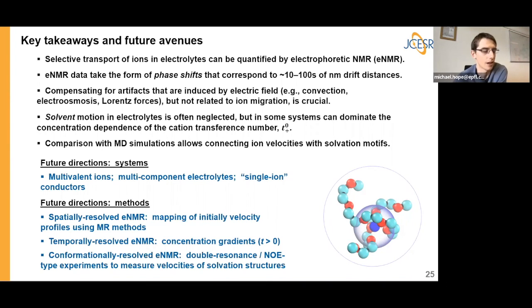Okay, thanks. Another question from Walt Musevsky, who says, why isn't the solvent drift driven by both cations and anions? Yeah, so that's an excellent question. In a lot of lithium-ion battery electrolytes, the role of the solvent, ultimately, is dissolving the salt and coordinating quite strongly with the cation. So there are a lot of systems, I would say the majority of systems, where the cation-solvent interactions are really strong, and the interactions between the solvent and the anion are not particularly strong. And of course, I didn't show the structure of the TFSI anion, but it's a very bulky anion, and the charge is very delocalized.